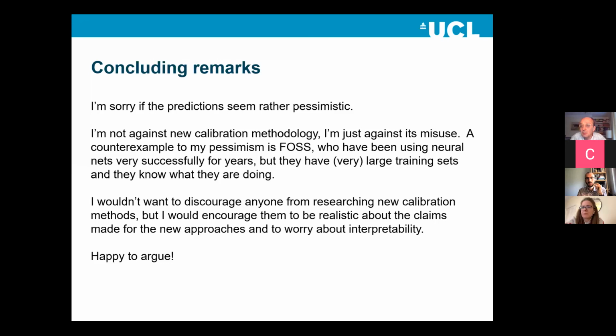Yes, absolutely. One thing to be said for wavelength selection, as long as you end up with wavelengths you understand, is that it's likely to give you a calibration that you understand. I think that's a big advantage for it. Obviously, you can also try and understand PLS calibrations. The ones that worry me are the ones where the entire thing's inside a black box and you don't know why it's working. And things can work by accident. So when IR calibrations work and you don't know why, you should always be extremely worried that they might stop working.